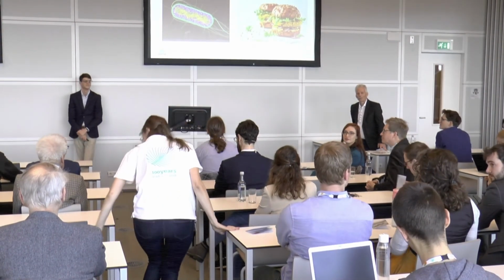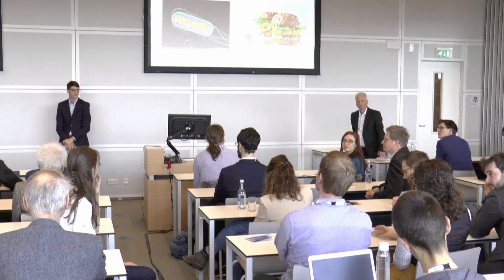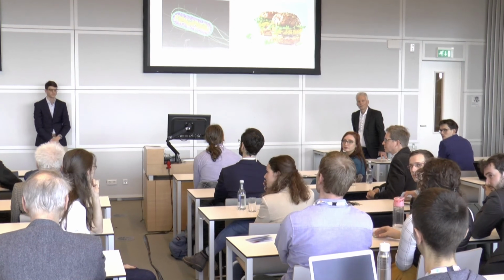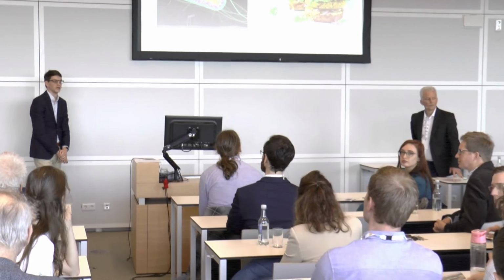Thank you for this very interesting presentation. What I was wondering is, of course, you identify the fluorescent tag. Do you have to make any corrections to find the specific location of the protein that you're actually tagging?